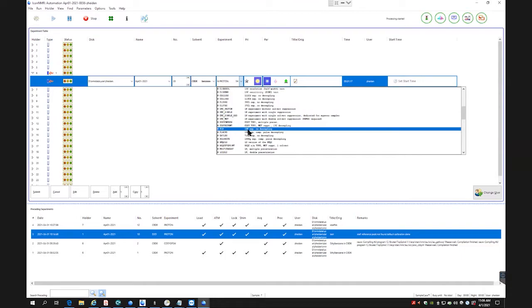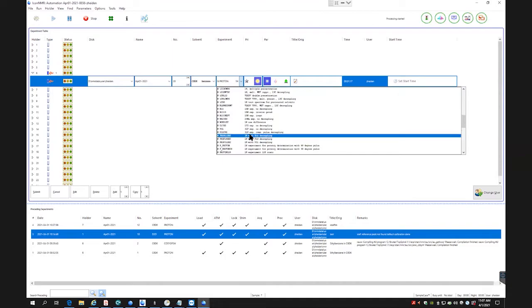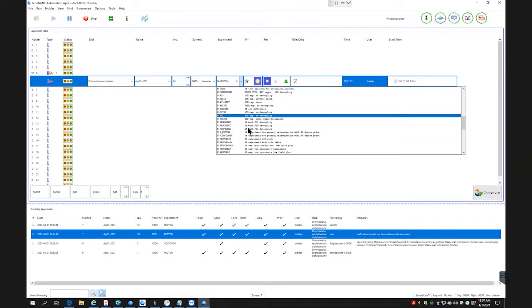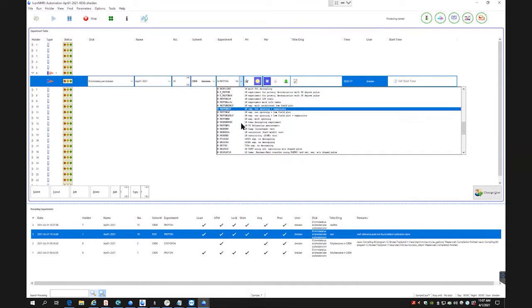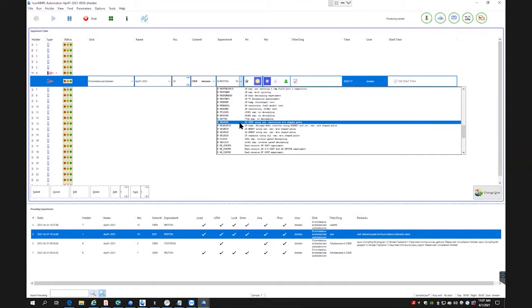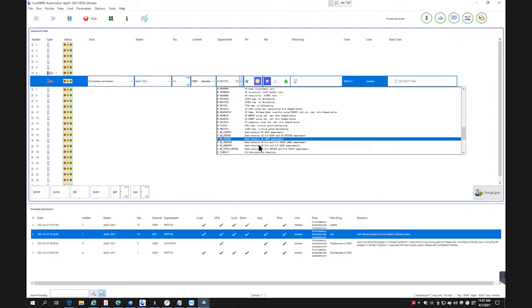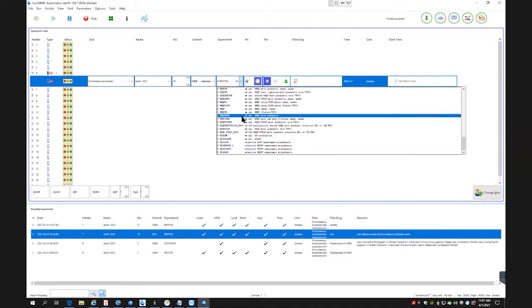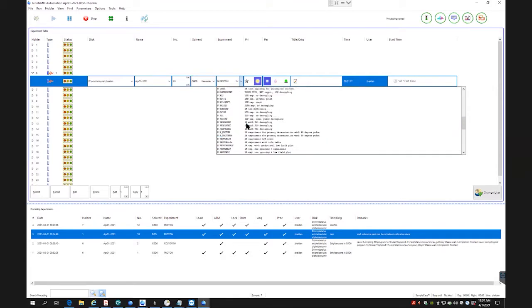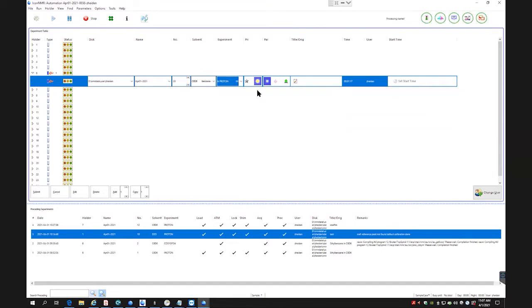There's fluorine-19. Some other 2D NMR experiments are there. Phosphorus-31 is here. And as we go down, there are just some other proton experiments with different pulses. You can also see that there's platinum-195 built in, or silicon-29, or even some TOCSYs or other things seen there. Depending on the experiments you want, you can click that there. So we're going to do a proton, so we click that.